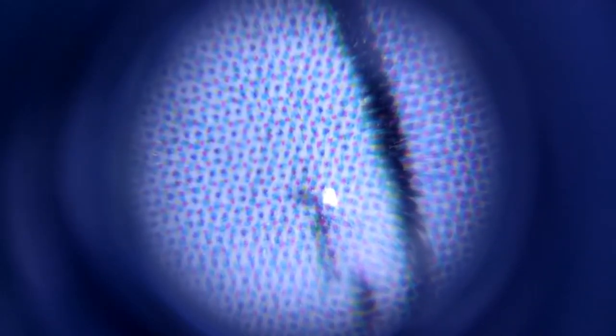This is cool. Now we're looking at my sofa, and it is leather-like. It is really old. Now you can see where the leather is broken. You can see very fine details with it.